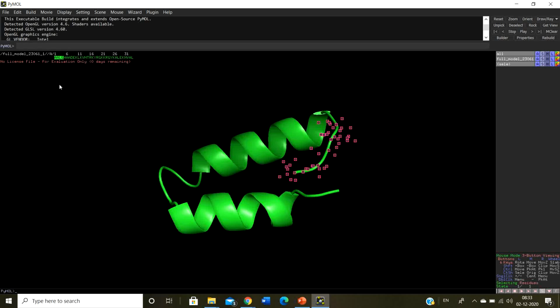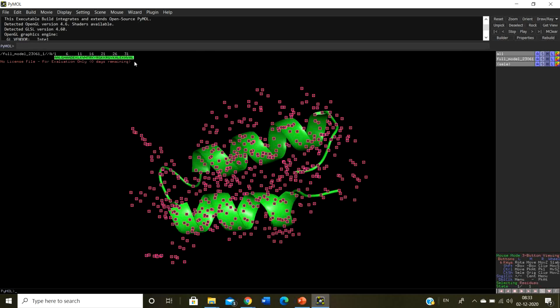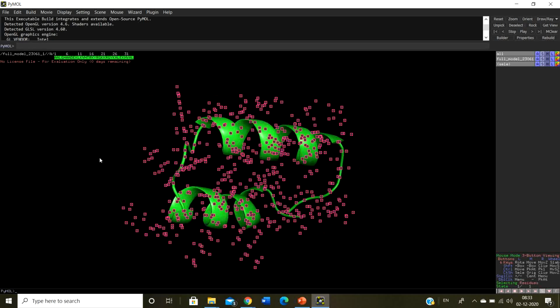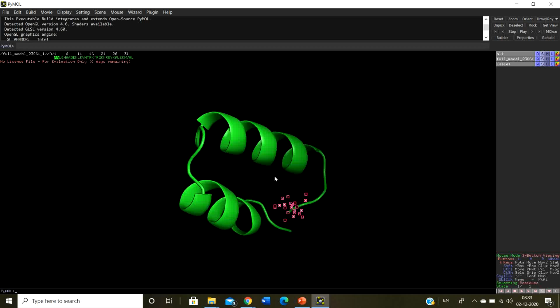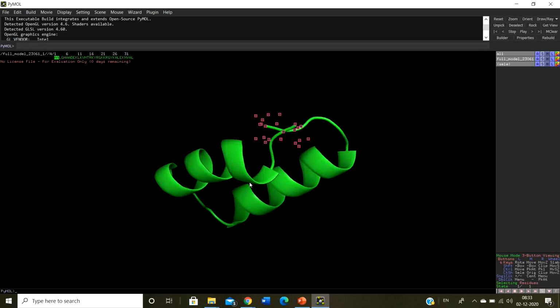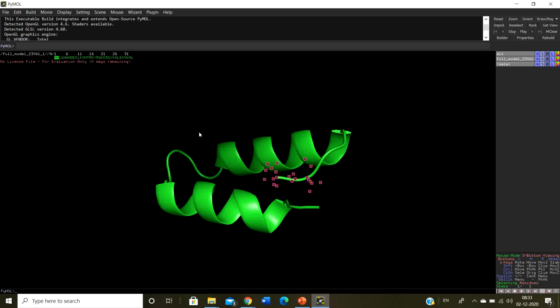As you select the residues in the sequence panel, you're going to see that those residues are actually marked in the protein. But in this case, since I have marked this area, it has marked some other area in the black space. Why is that? Because in this particular condition, this conformation is only for a cartoon model. This is a cartoon model.